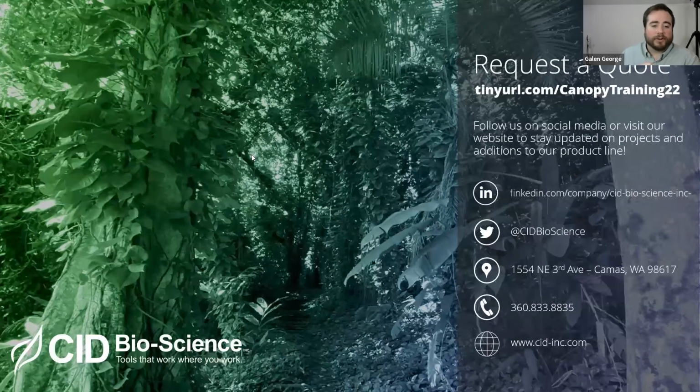The next question from Nyan is, sunfleck is always coming in as 100%. Probable reasons? Probably because there is a constant light being shown on this instrument here, and so it's identifying that as PAR. It's coming in as sunfleck.